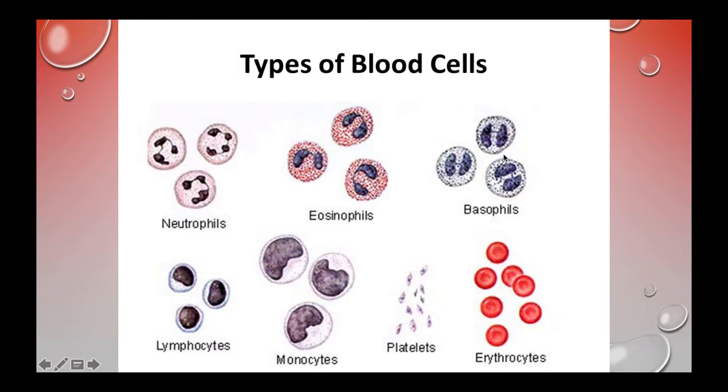And then we have basophils. Basophils also have a bilobed nucleus and cytoplasmic granules. However, you'll notice that these stain dark purple or blue, very different than the red eosinophils. Your basophils are responsible for releasing things like heparin, which is in those cytoplasmic granules, as well as histamine. So they'll be involved in that allergic response as well. And so those are your white blood cells. All of these are your white blood cells. And then we have the platelets.